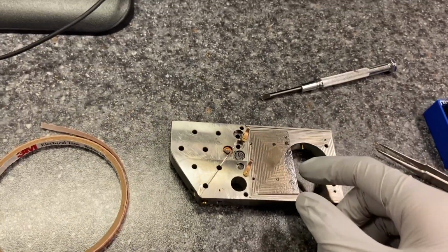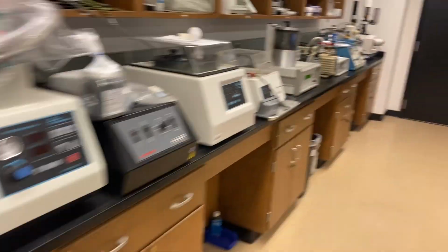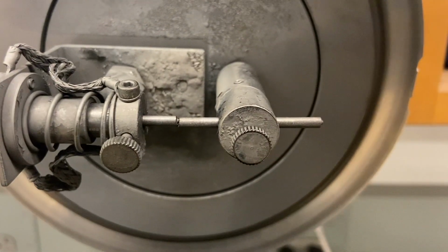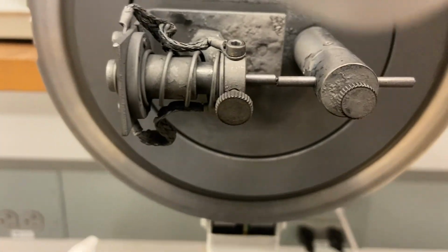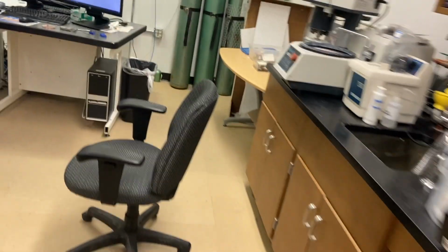So here I've carbon coated my samples using a thin layer of carbon that's deposited by vapor deposition on top. And how that works is I go to this sort of carbon coater right here. You pretty much put your thin section in there. You have these two little rods of carbon with a graphite with a little space in between. You heat it up and you basically vaporize the graphite, and inside of a vacuum it's able to nicely settle onto your thin sections. If you didn't have a vacuum, of course you have air and that can disrupt the deposition process, so we do it in vacuum.